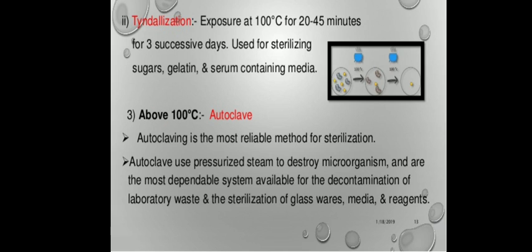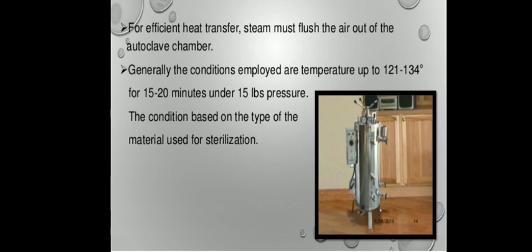Generally different types of glasswares are there, medias are there, then reagents are there. All these materials are heated to 121 degrees Celsius for 15 to 20 minutes under 15 lbs pressure.